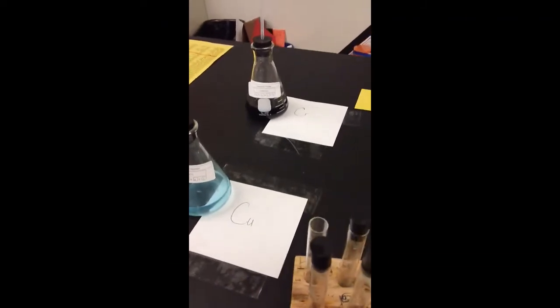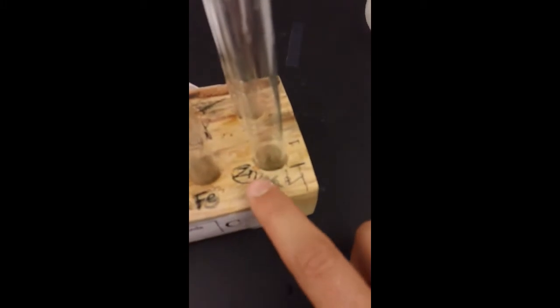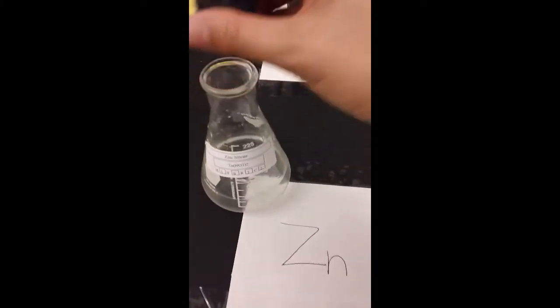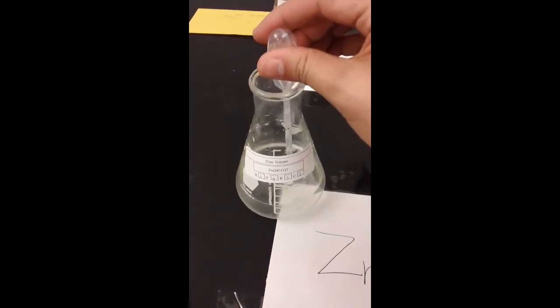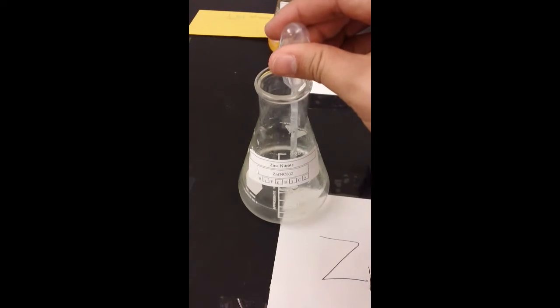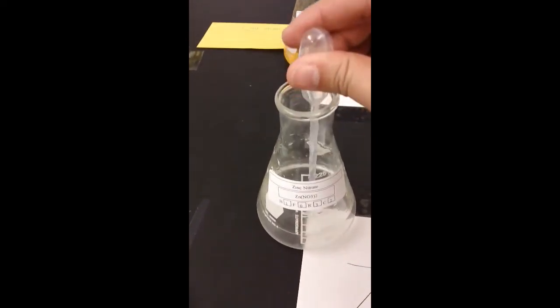So I'm going to start here. Notice how this one down here says Zn, so I'm going to put 1 milliliter of the zinc nitrate in here. And 1 milliliter, as we know, is just to the top, or about the top of our pipette. So that goes in there.